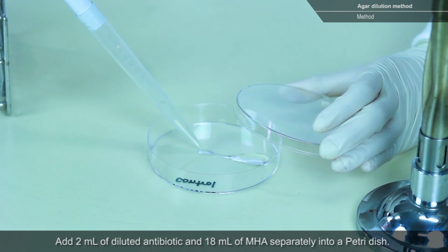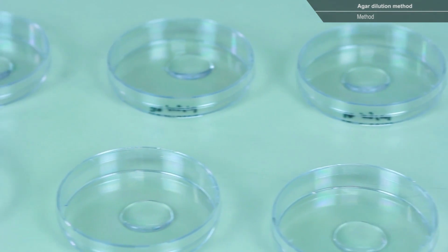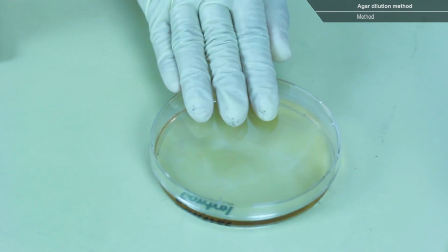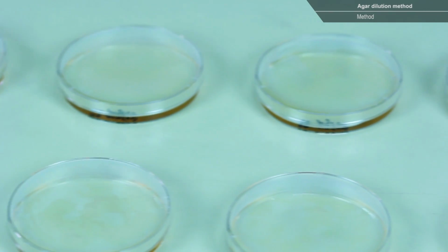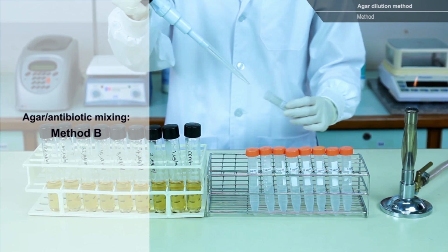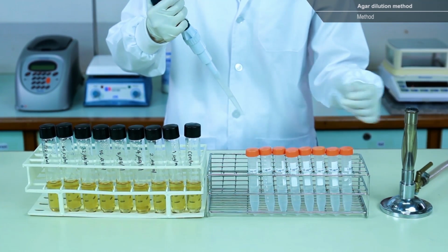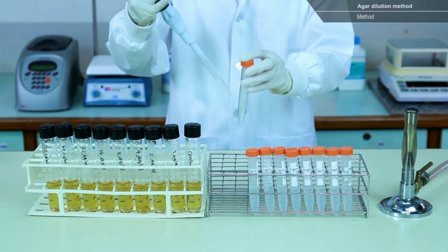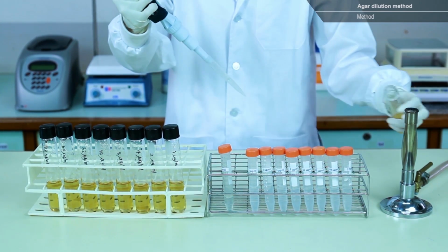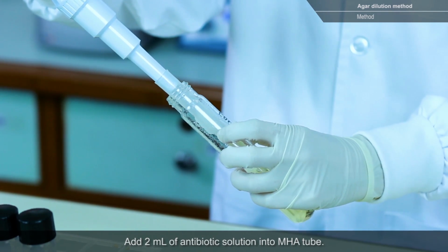Add 2 milliliters of diluted antibiotic and 18 milliliters of MHA separately into a petri dish. Mix thoroughly, ensuring no bubbles are formed. Add 2 milliliters of antibiotic solution into the MHA tube.